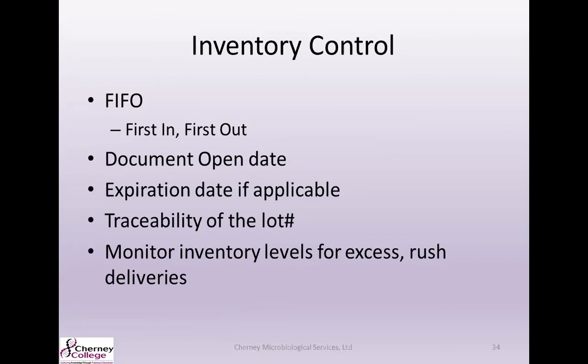Document for traceability your lot number, when you started using the new lot, when you ended using the previous lot. And you're going to want to monitor your inventory levels for excess. You don't want to have too much inventory on hand where you're going to risk not using it up before it expires. But in that same way, you don't want to have a situation where you've got to rush ship samples there. So you want to make sure that you have enough inventory on hand for the testing that you're going to be doing.